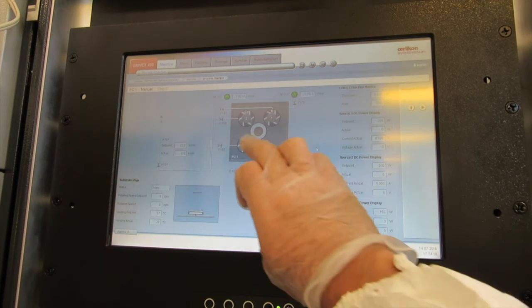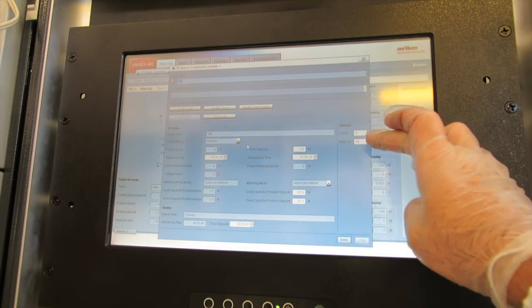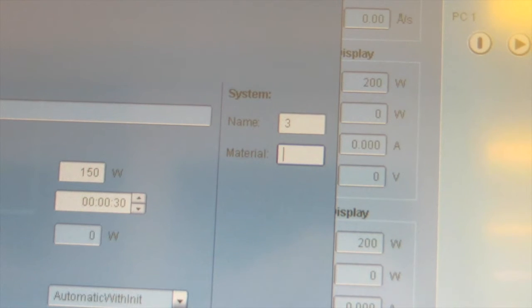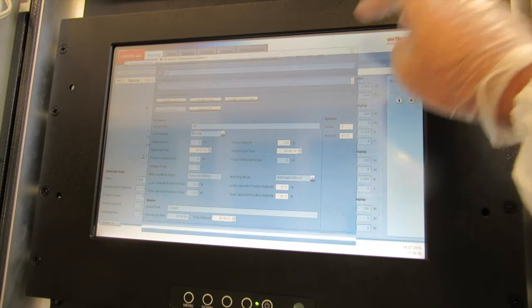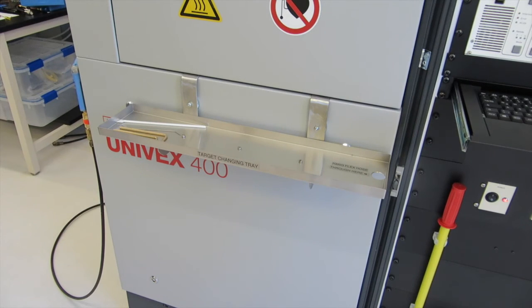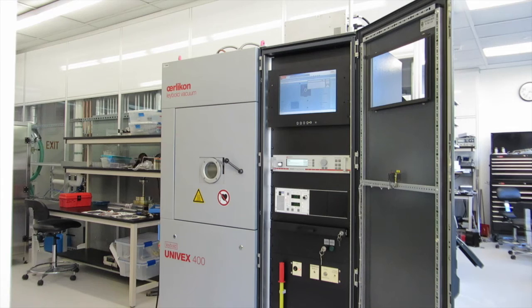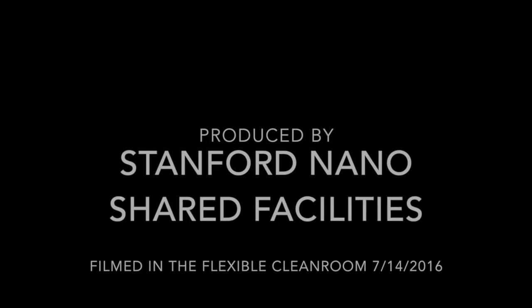So since we changed the target at number 3 from iron to SiO2, we need to go in and enter on this display right here. You touch that and then you enter SiO2. Close the chamber door and you're ready to start a new run. It's okay to leave this tray here on the front when you close the chamber door, but there's no way to remove it once the door is closed. If you don't want it there, you can stick it back on the side of the machine before you close the chamber door.